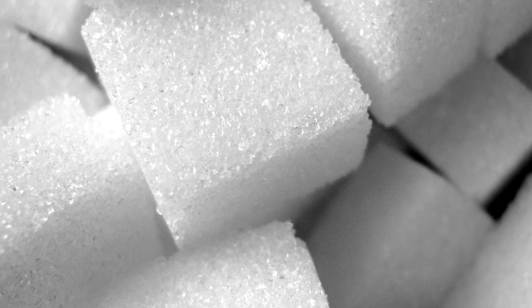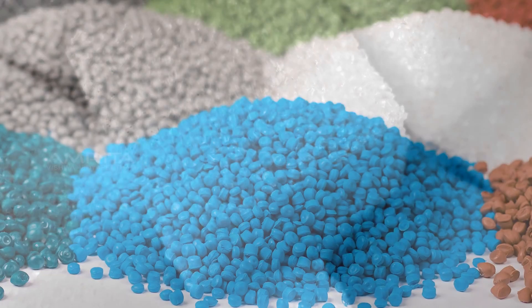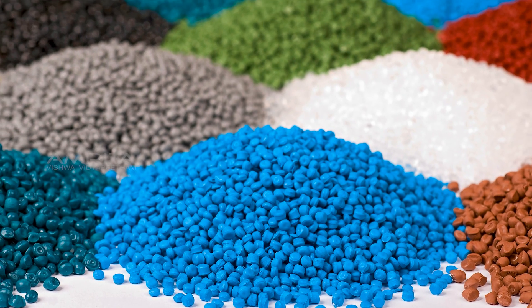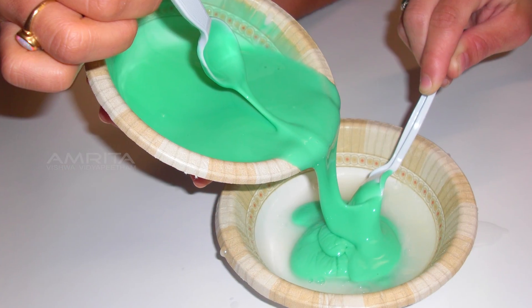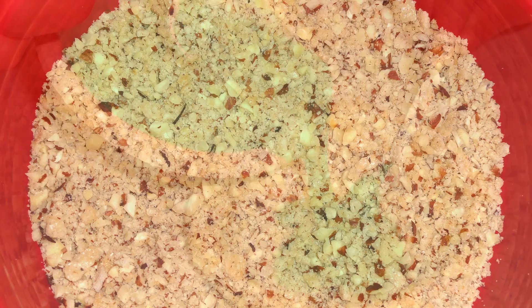Separating Funnel. Most of the matter around us is a mixture of two or more components. Mixtures are either homogeneous or heterogeneous.